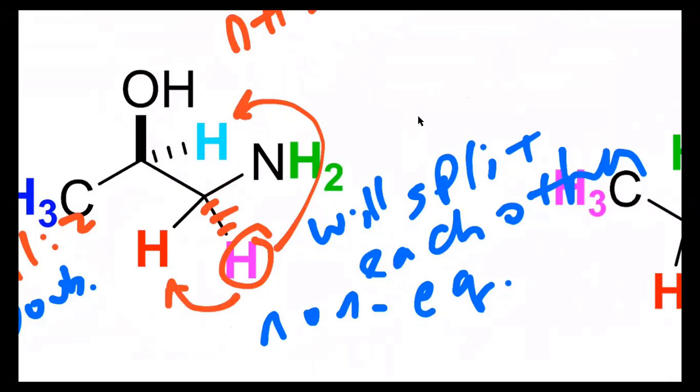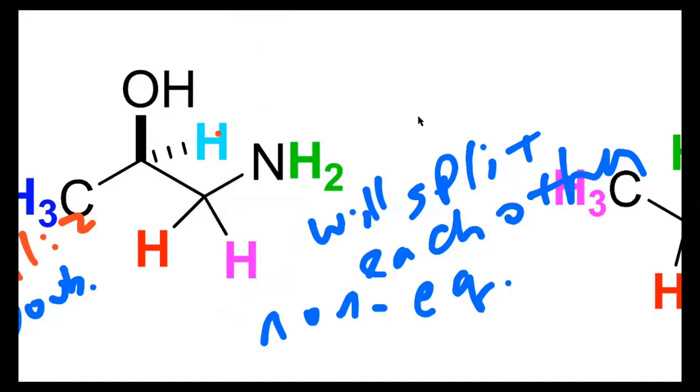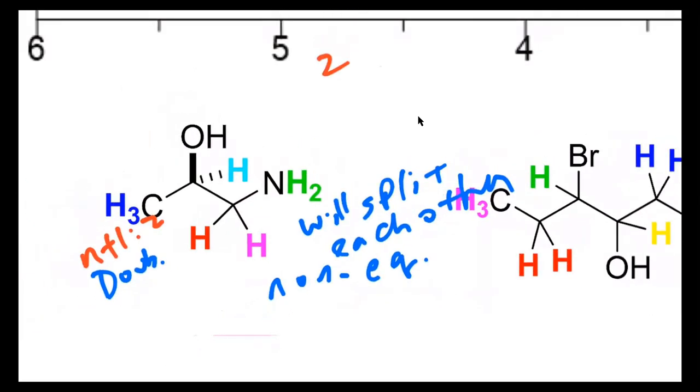Okay. So you're just counting that hydrogen attached to the chiral center one time, and you're not combining that hydrogen with the other hydrogen that's next door to it. Yeah. That's a good question. It's a great observation. So it wouldn't be a triplet. It's going to couple twice, so it'll be what we call a doublet of doublets. Any questions about that? That's why I wanted to do this example first, because this is the most difficult one out of all of them.